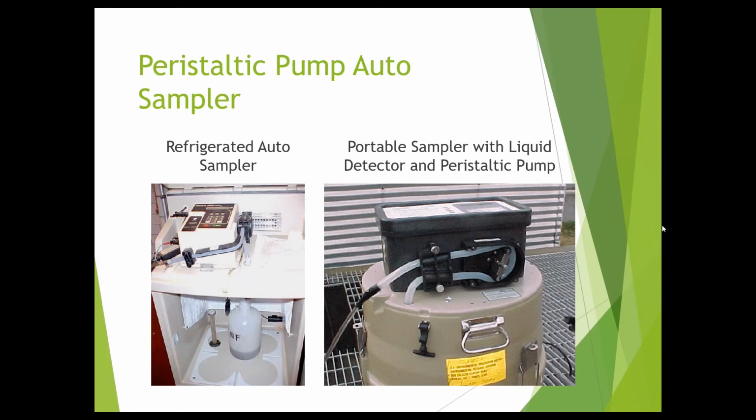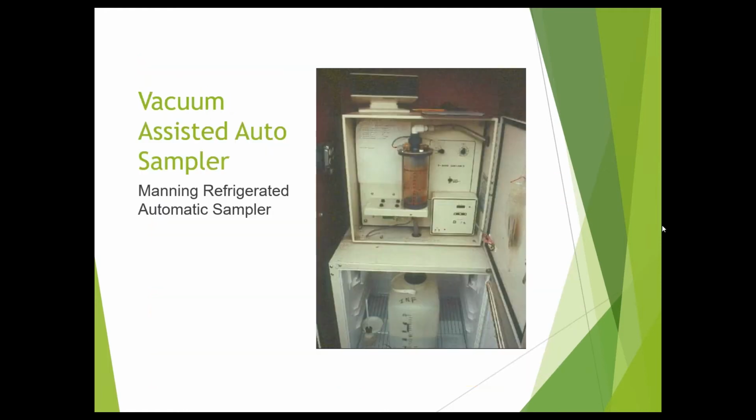Here's a vacuum assisted sampler. So basically, I think there's like 3 steps to this. The first one is it pulls the vacuum, which clears the line, and then it fills up the volume container. It opens a valve, releases it, and then when it pulls the vacuum, it clears the line again, wash, rinse, repeat. Again, more steps, but notice this is taking a smaller aliquot.